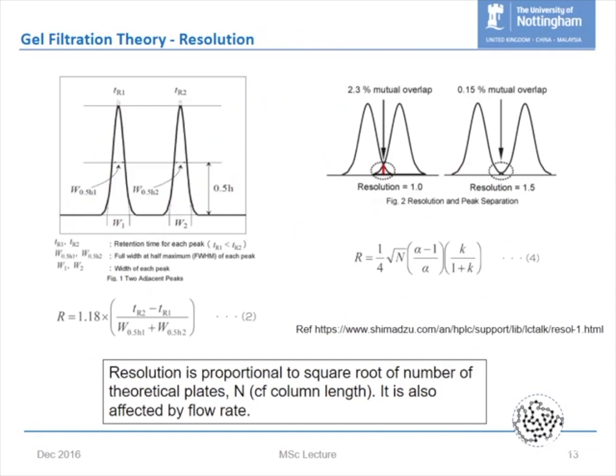Okay, so that's just another form that you use if you're using the larger columns that I've shown down there. Now I've spoken briefly about the importance of separating things and something called resolution. Resolution is a fundamental part of chromatography, and I wanted to give you an overview of what it is. There is no substitute for resolution, incidentally. Any chromatographer likes to pull the peaks apart because then they can be detected singularly and there's no confounding of the analysis because one is overlapping another. That's pretty much where we want to go.